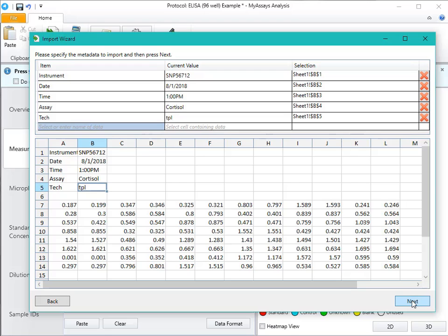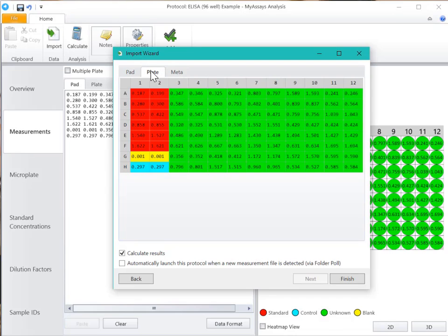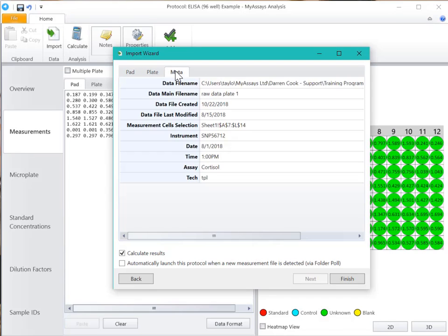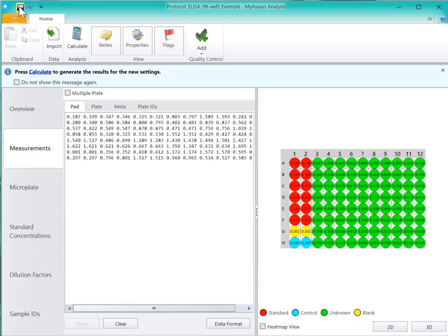I'll click Next. Now you can see the data in a pad format, plate format, as well as the metadata that we selected. I'll click Finish. And now if we choose to save the protocol, these import settings will be saved for the next time the protocol is used.